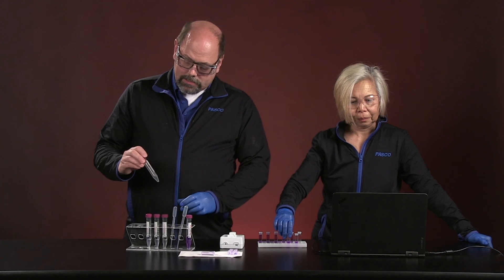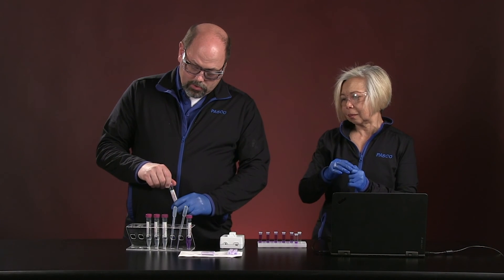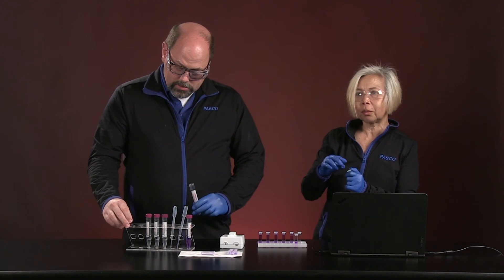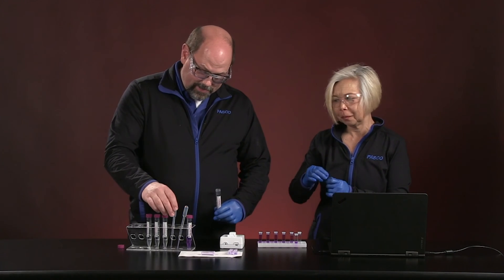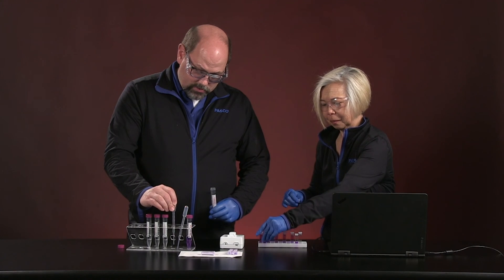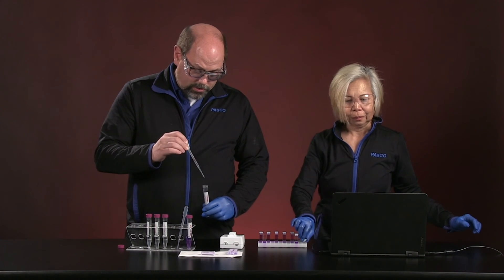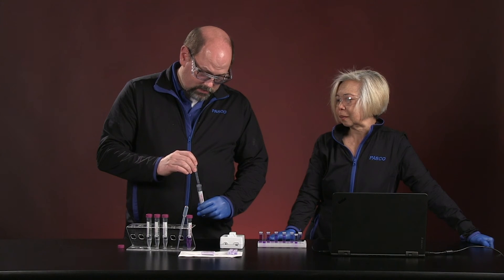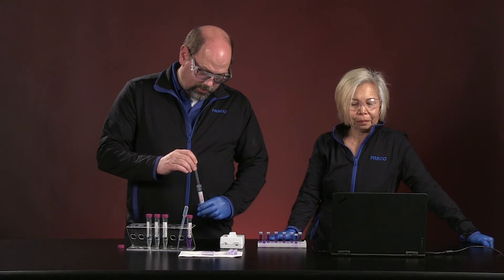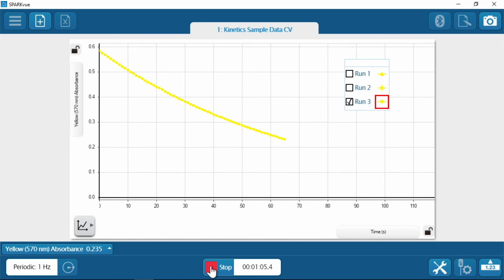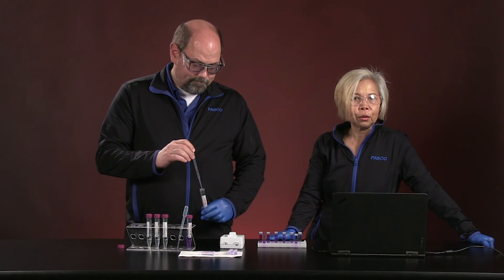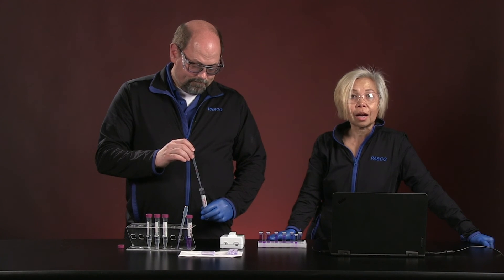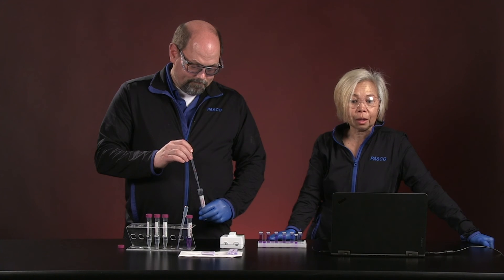While that's finishing up, I have one last solution and that's drain cleaner. And that's a little more concentrated yet. Correction. Cheap drain cleaner. Cheap drain cleaner. That's right. So what do you think is going to happen as I add this more concentrated solution to my crystal violet? You'll have a minute to think about that while we finish this last reaction out. This is a good time to predict whether you think drain cleaner has a higher sodium hydroxide concentration than 0.2.